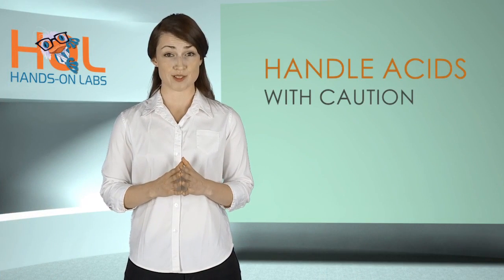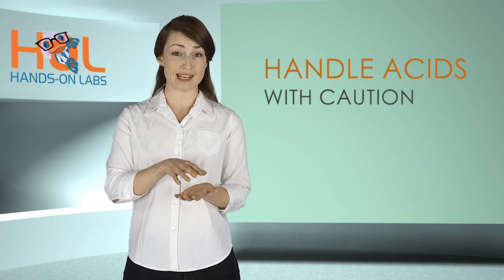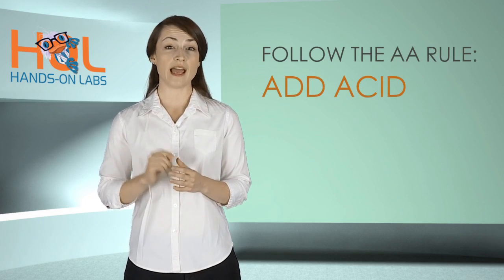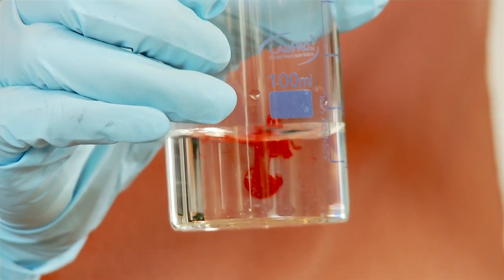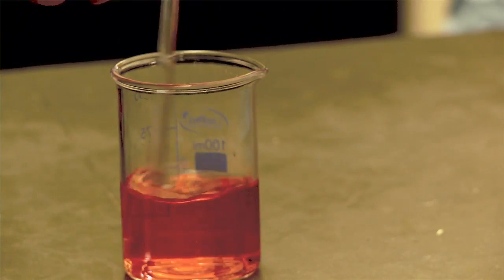Acids are chemicals that can cause severe burns, so handle them with care. Never add water directly to a concentrated acid. This generates heat and can cause dangerous splattering that is similar to what happens when you add water to hot oil. The proper way to mix acids with water is to follow the AA rule, add acid. You should slowly add acid to water while stirring the water with a glass rod. Never the other way around.